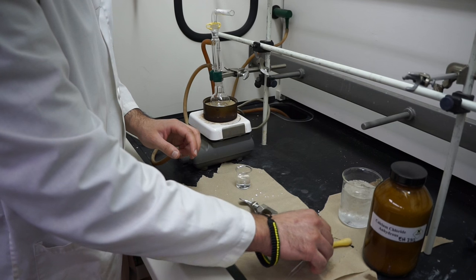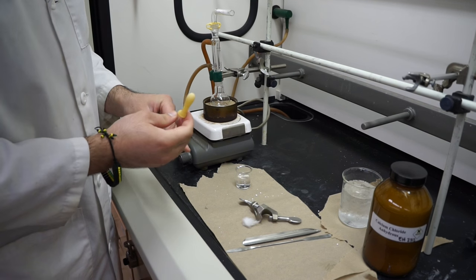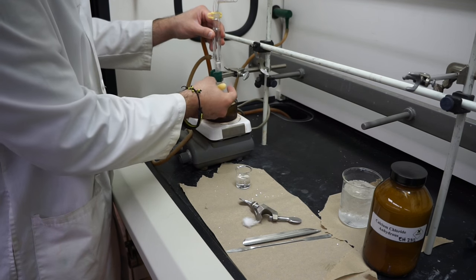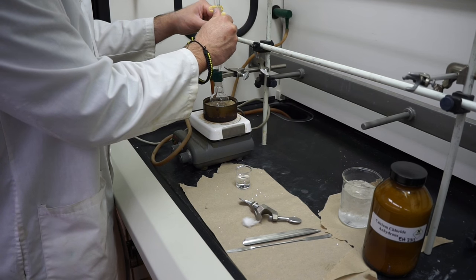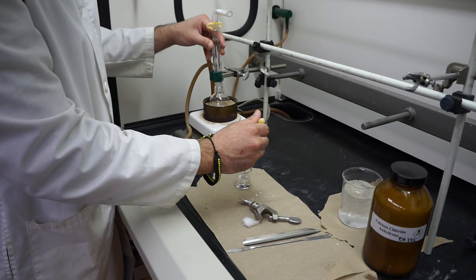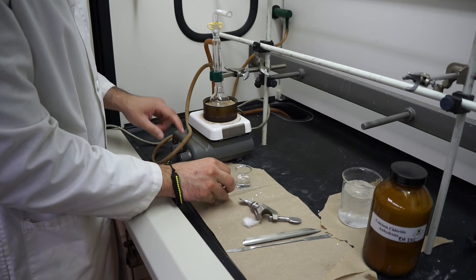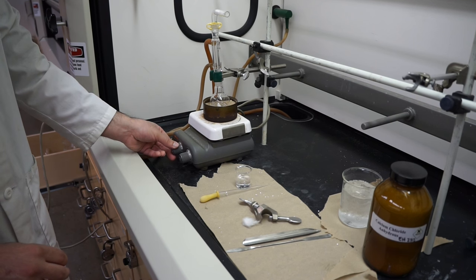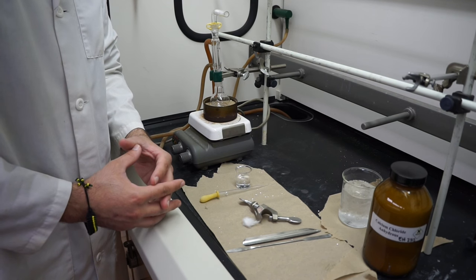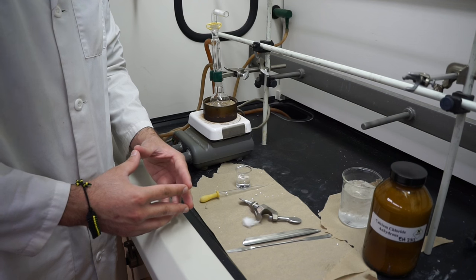Once everything is set up, you're going to take your reagents — probably your diethyl ether and your bromo butane dissolved in diethyl ether — and use a Pasteur pipette. You can take the water-cooled condenser off and add a few drops or however much you need through the top, then quickly reattach. From there, turn on your stir bar and let it stir. If your reaction goes well, the mixture should turn cloudy and most likely have a grayish tint. If it doesn't after five minutes, call your instructor over and they will add some iodine to kickstart the reaction.